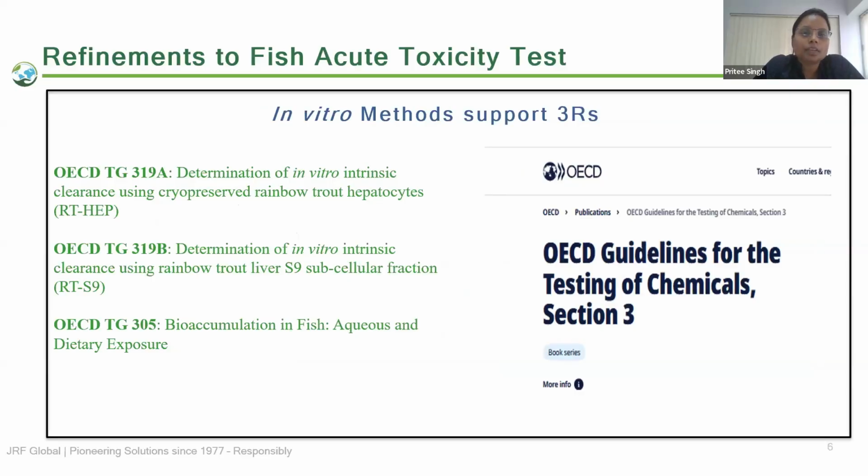So here, a suspension of enzymatically active cryopreserved hepatocytes, or hepatic cells, is exposed to the test chemicals. Then the reactions are stopped at specific time intervals by adding a stopping solution, and with a validated analytical method, the decline or decrease in concentration is measured. On this basis, intrinsic clearance is calculated, which is important for predicting the toxicity of a chemical.